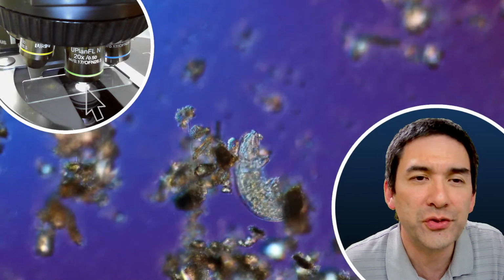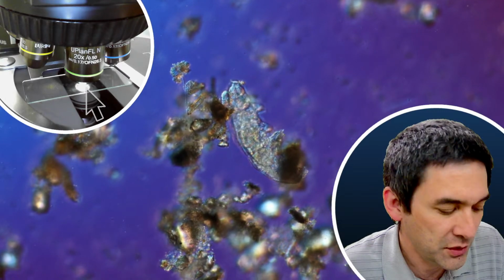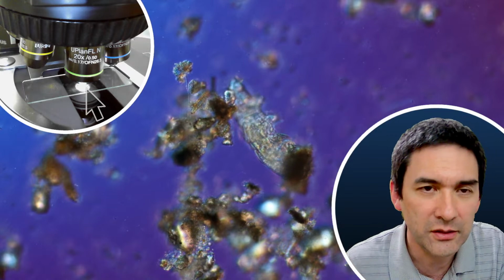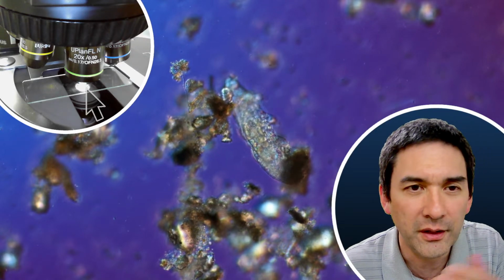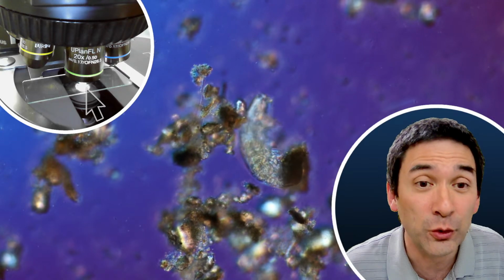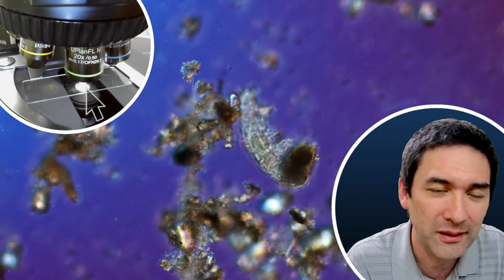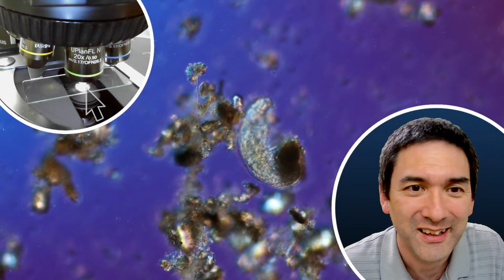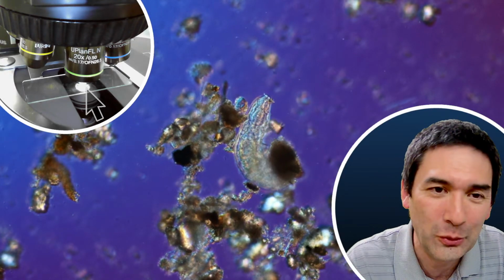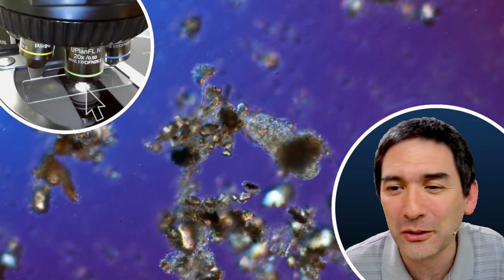Actually, this afternoon I tried to use my pipette to isolate some tardigrades, at least the few that I found, from the other solid material, because I wanted to get rid of all of the sand and the solid material. This was very difficult to do because it was always clinging to the sediment with its hind legs and didn't want to separate. With the front legs, it was always looking for something to hold on to, but with the hind legs, like right now, it was always clinging to some solid material.